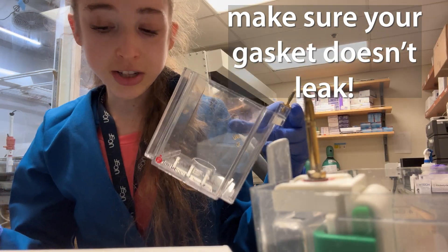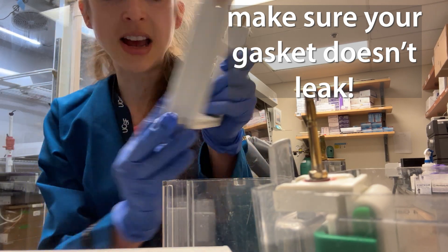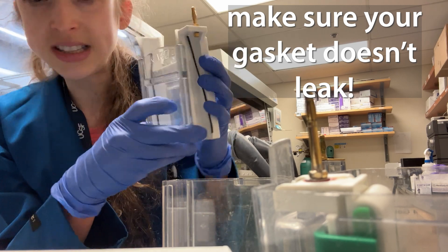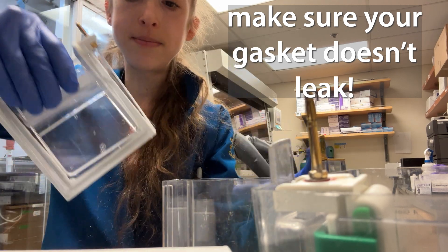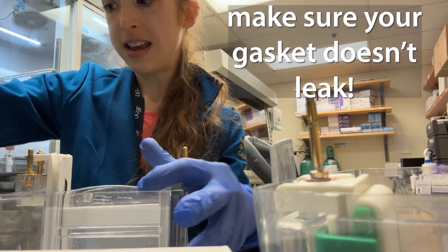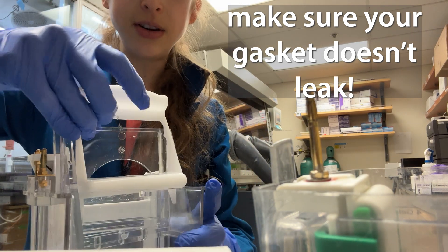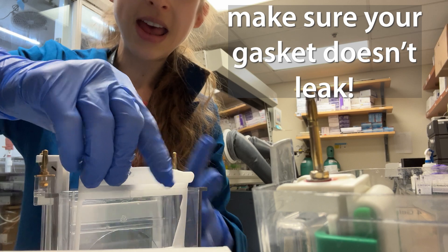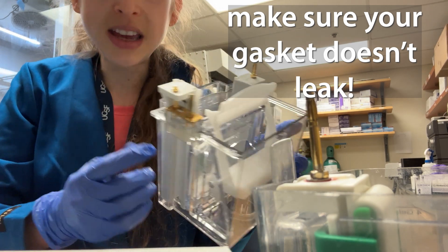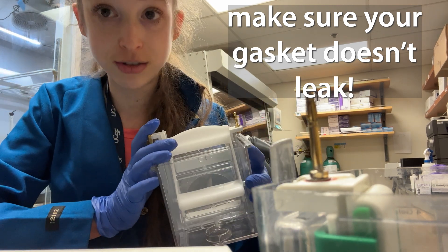If you're using one of the Novex gel boxes, they don't have that ledge. In this case, make sure you're snug against the bottom on both sides. Hold it tightly snug against the bottom, then stick it in. This wedge goes in here — hold it tight when you're wedging it down, and then once it's in, snap it. This should now be tight. Again, fill the inner chamber first and make sure it's not leaking, then go ahead and fill the outer chamber.